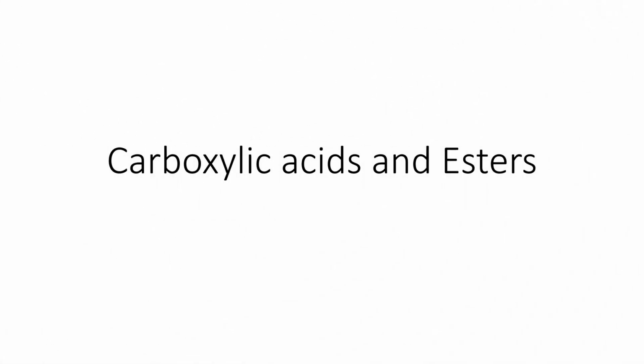This is going to be our last experiment. This is carboxylic acids and esters.